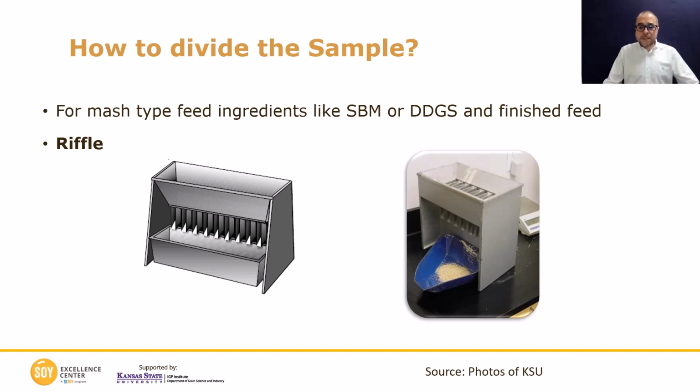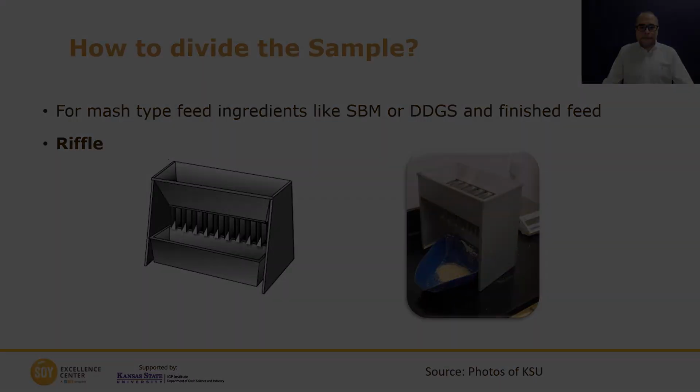They're doing it in an objective way, and that's where we're looking. Because if you do it by hand, by putting that sample on a table and dividing it yourself, then you're starting to introduce human error, and then it will become a little bit more subjective. So this type of equipment is essential in order to divide samples into smaller quantities that are correct for doing the different types of analysis they need to do to quantify quality.